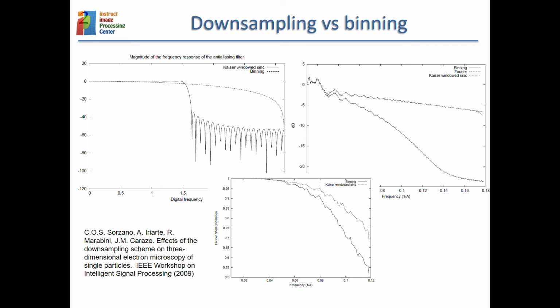Now they are normally using Fourier cropping, and this Fourier cropping is actually the right thing. If you want to do it in real space, you could first convolve with some kind of filter like this one, and then do the downsampling. So the right operation is to put an anti-aliasing filter and then do the downsampling, or do the Fourier cropping. That is the way it is done.